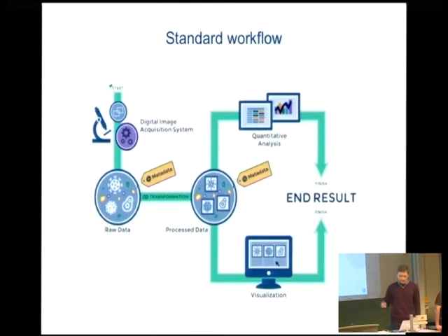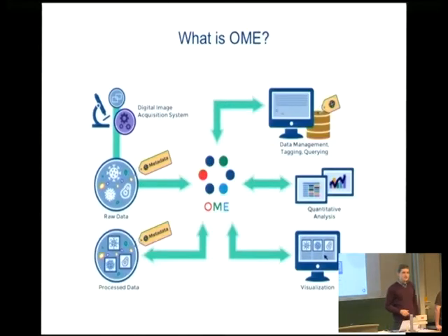So, seeing the workflow, one might ask how does OME fit in? The consortium that we both represent, OME tries to be this broker, this glue that sits in between the image acquisition system, the users, the presentation and storage elements. We don't solve all problems for the scientists, but we try to solve the ones that are the most common. And we also, under the OME umbrella, facilitate cooperation between commercial partners, us developers, open source projects that build on top of our API. So we try to basically facilitate cooperation.